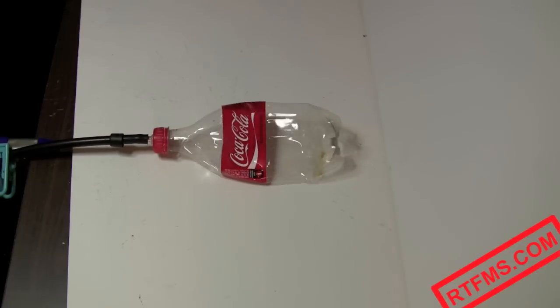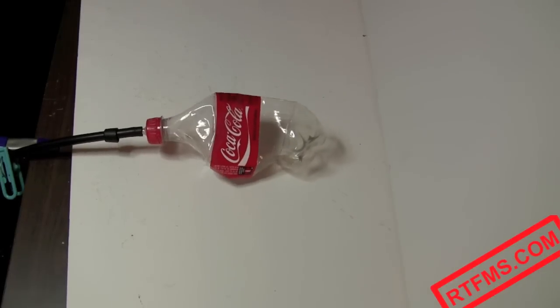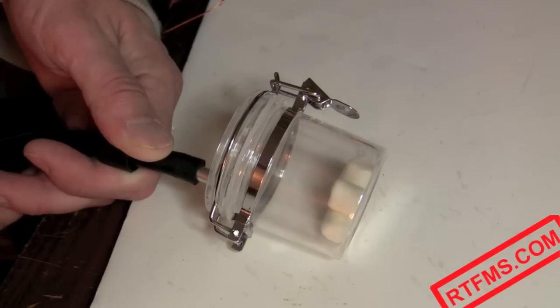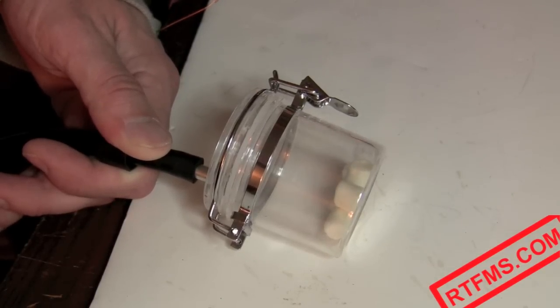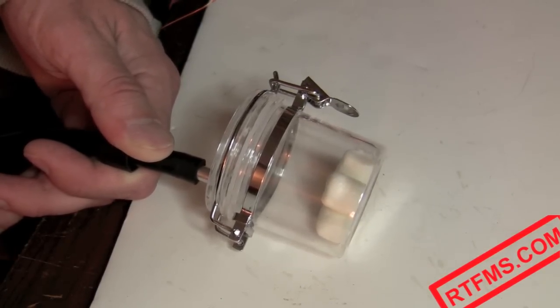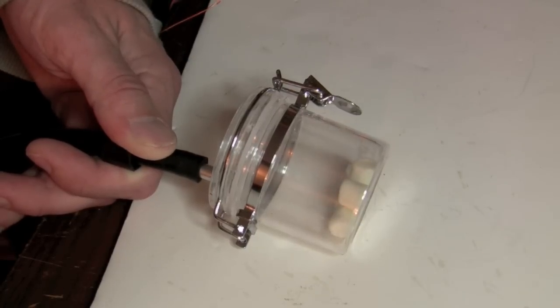So, here is our vacuum pump and chamber. You can use it to squash plastic bottles or inflate marshmallows. In the following episodes I'll show you how to use it in a more scientific manner. Keep watching RTFM's video blog!